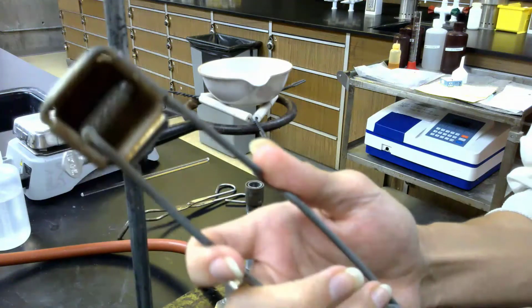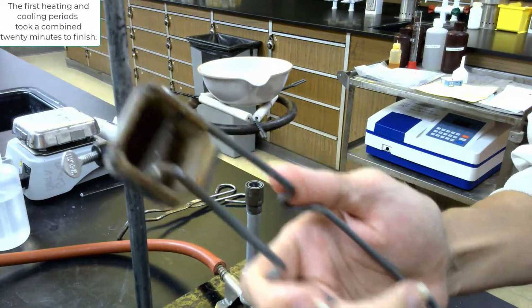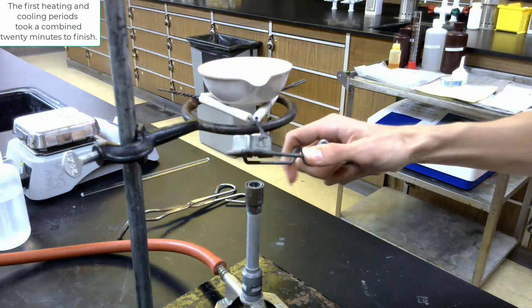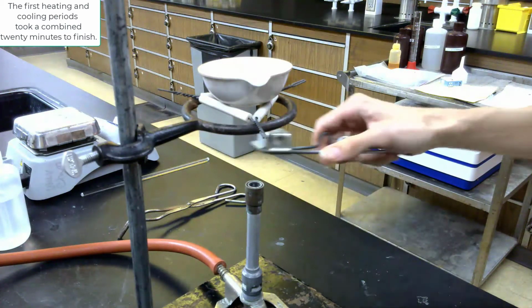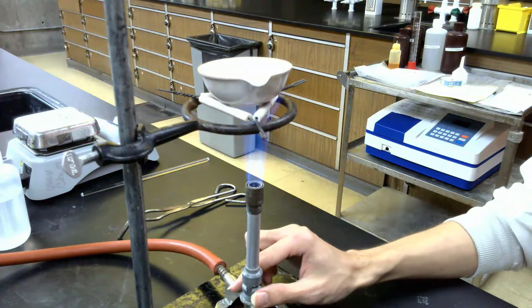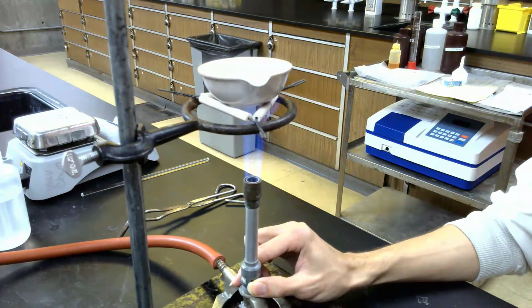These strikers are ancient, and so sometimes it takes a minute to get a good enough spark to light the Bunsen burner. So I'm just going to put it over the burner like so. There we go. Okay, and that's my flame. I'm just trying to center the flame a little bit.